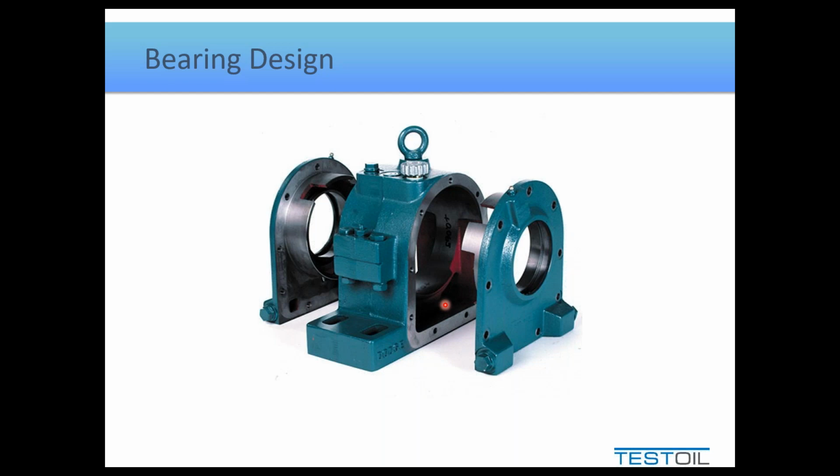So the answer to our problem that explains everything is understanding this is what the bearing looks like. Right? In here, we have the oil that was being sampled. This is where the oil would go in. But when this is all assembled, there is the Zerk fitting for the seal that goes around the shaft on this side, and there's also a Zerk fitting for the seal on the other side. At some point, somebody has over-greased that seal and blown it out. And some of that excess grease went into the oil, which explains the calcium and the phosphorus, but without the increase in viscosity. The blown seal then explains why the dust and the dirt and the particle count substantially increased to the point where it just abraded the bearing till the point of failure.